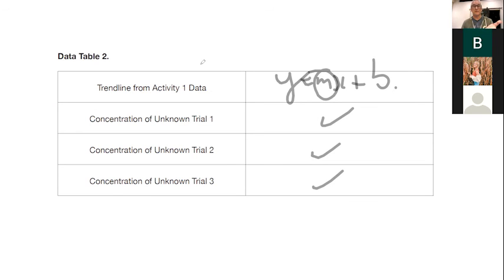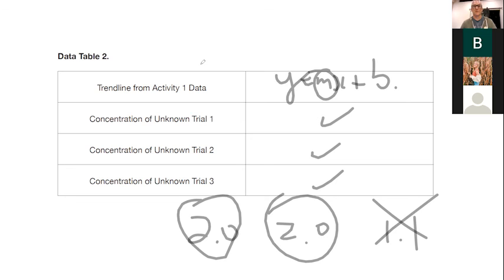But when we do this sort of work, we always do things in triplicate because if we get an answer of like, let's say 2.0, 2.0, and 1.1, we pretty much know that this one is an outlier and this is the answer we're looking for. So that's why we always do things in triplicate. Sometimes we do things in quadruplicate, but generally in triplicate. Because if you make a mistake, it doesn't get factored into the final answer. And we all make mistakes. I mean, hell, you saw what I did here.